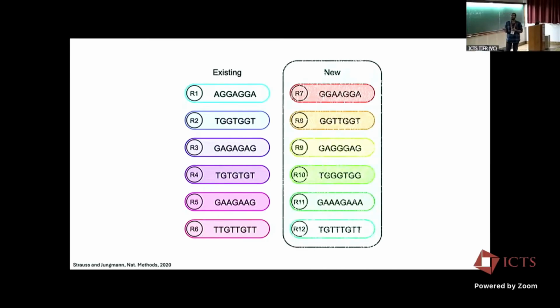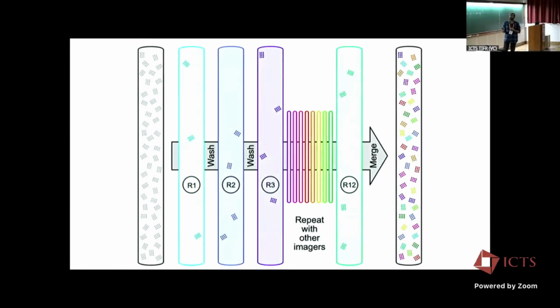imaging. We have come up with another set of 6 imagers with almost similar binding kinetics, which allow us to theoretically do 12 rounds of fast DNA-PAINT imaging. And as a proof of concept, we took origamis carrying 12 unique docking strands, and we did simple Exchange-PAINT, where in each round of imaging you simply replace the imager strand, adding a different imager.